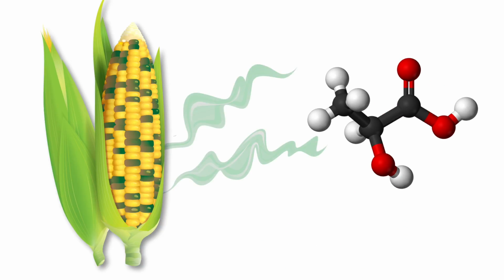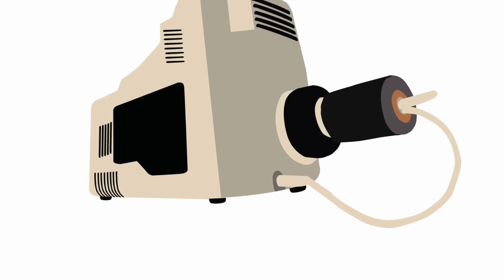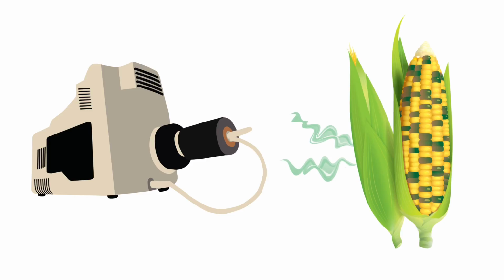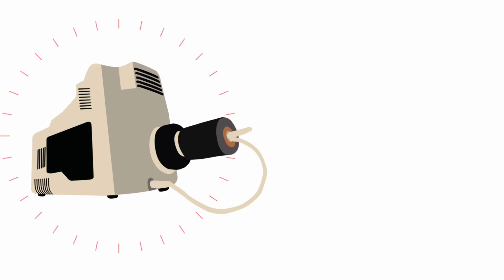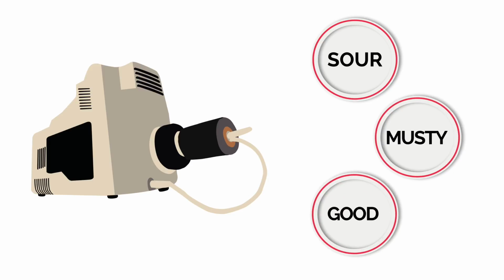Also, the primary acid produced by corn fermentation is lactic acid, that often gives fermented corn a sour note. Z-Nose helps in detecting the damaged moldy corn kernels by quantifying the musty odor. To speculate the efficiency of Z-Nose, sour, musty and good corn samples were evaluated.